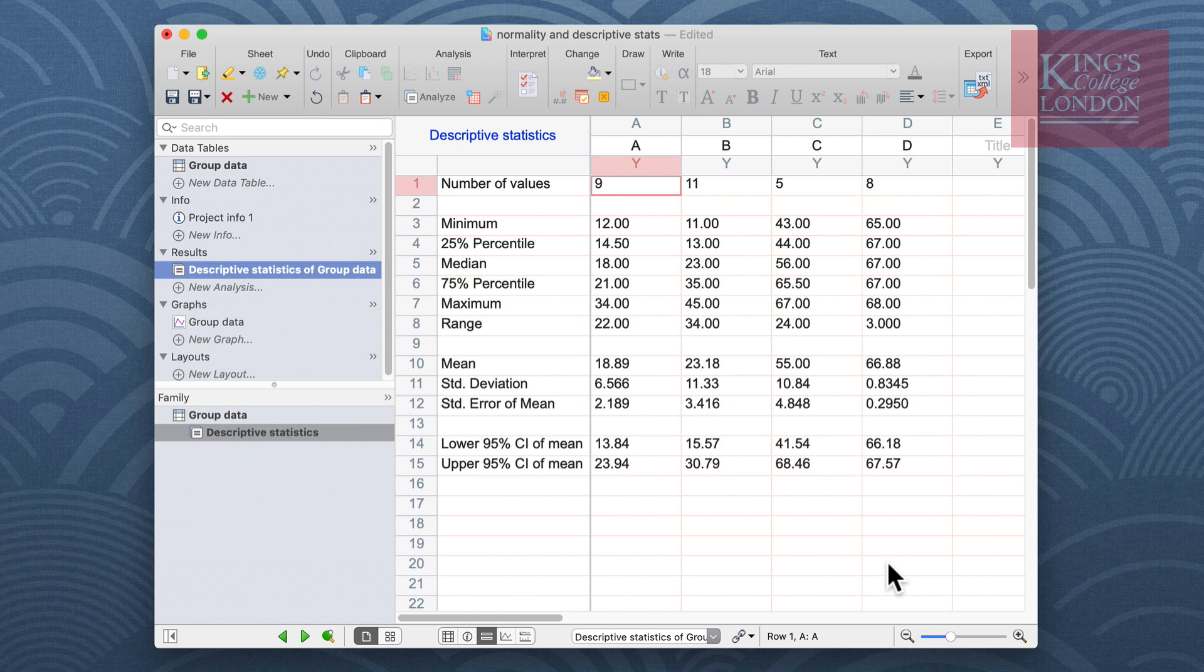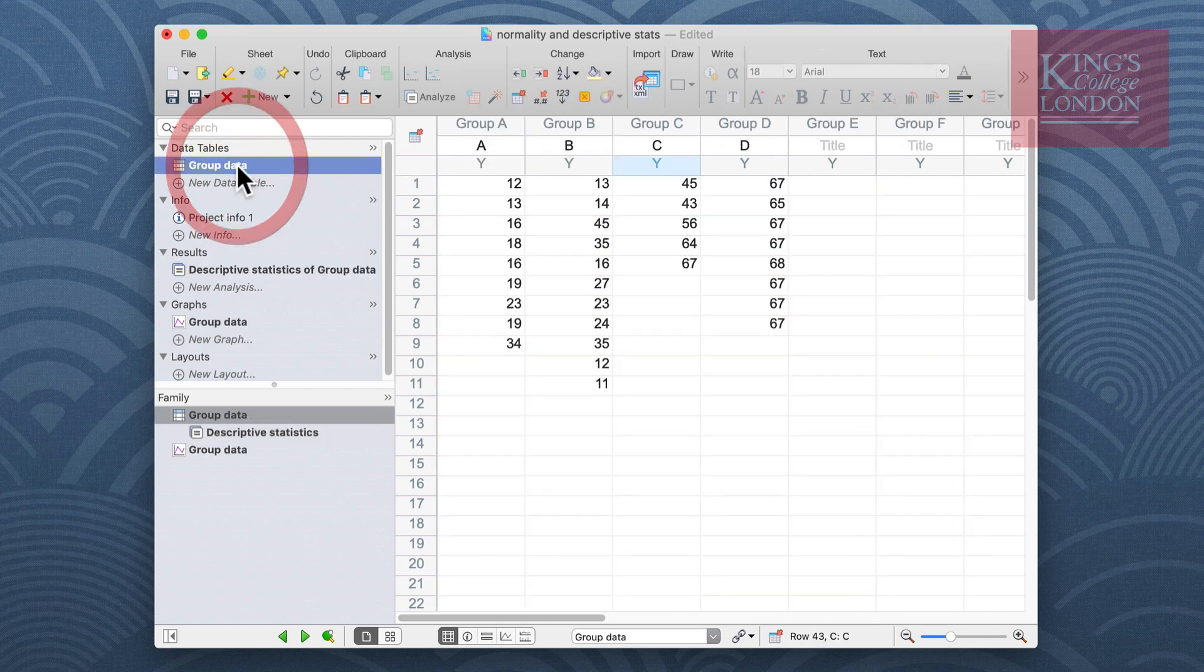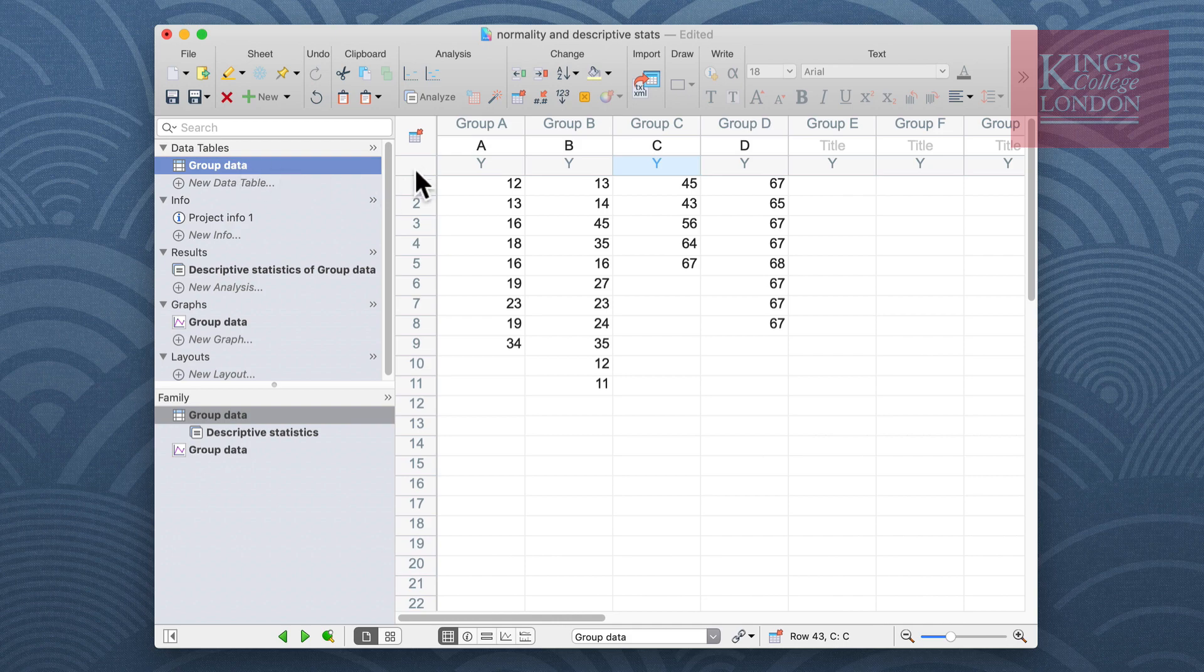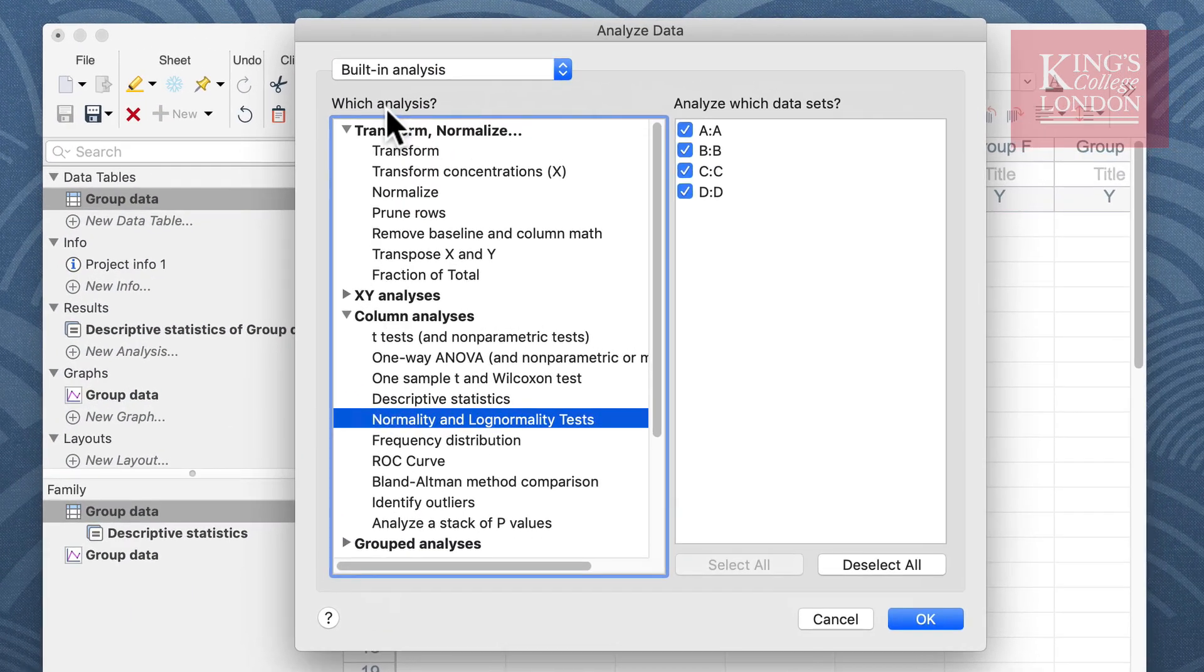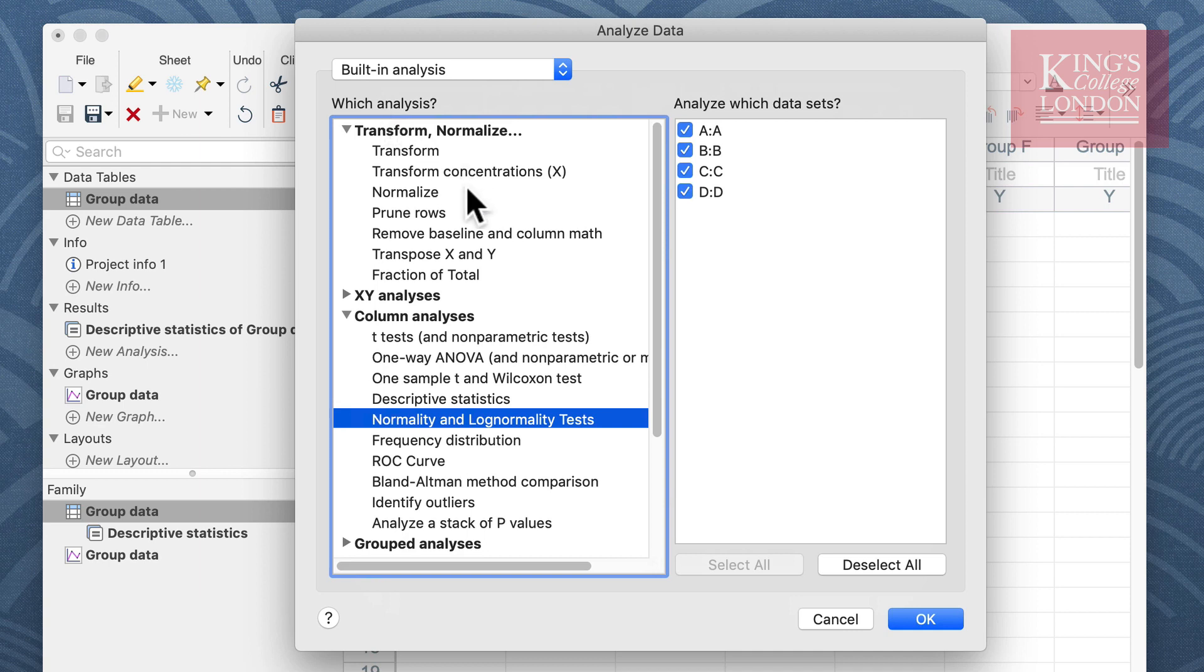We're going to return to our group data table and we're then going to click again on the analyze button. Once more the analyze data window appears and from the left hand side we choose normality and lognormality tests.